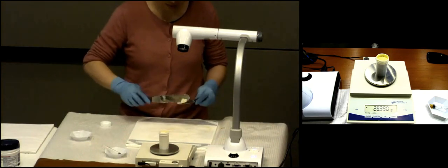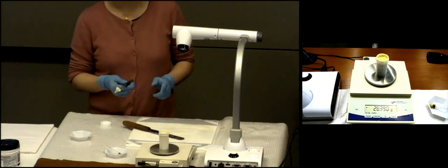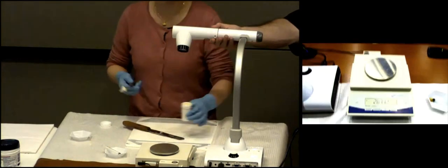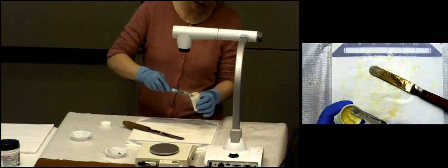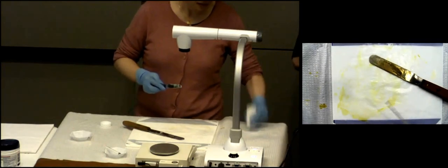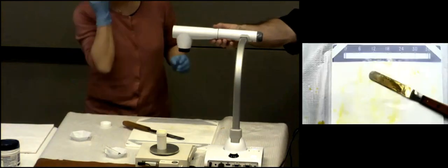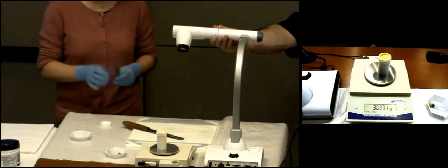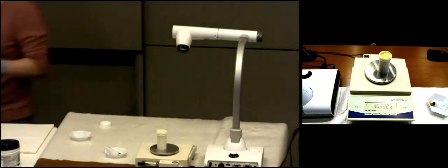So did Judy make it to the low end of the range? Are we there? No, not quite. Fortunately, not quite. But luckily, I still have one little bit left on my spatula. So let's add this in. But let's look at her parchment paper there. Do you see a bunch left? How much did we start with? 33 grams, right? So scooping up everything she possibly could, we're down to 30.332, if you will, okay?